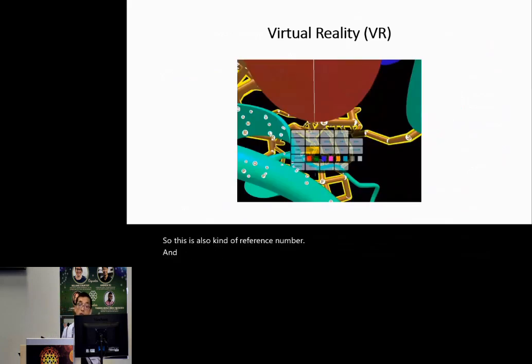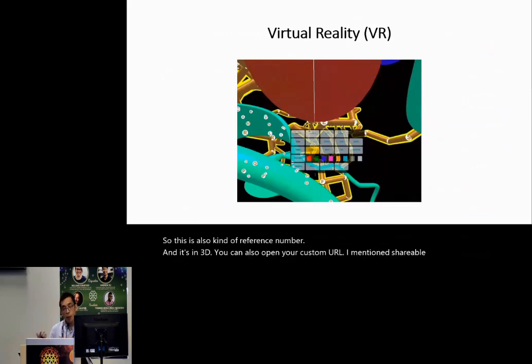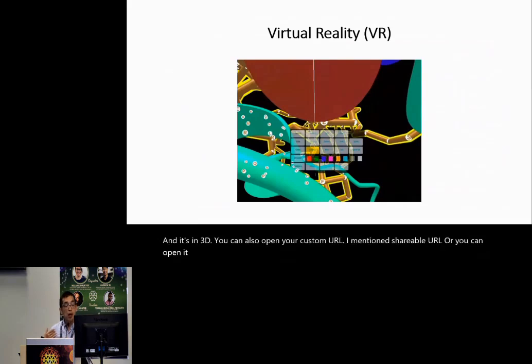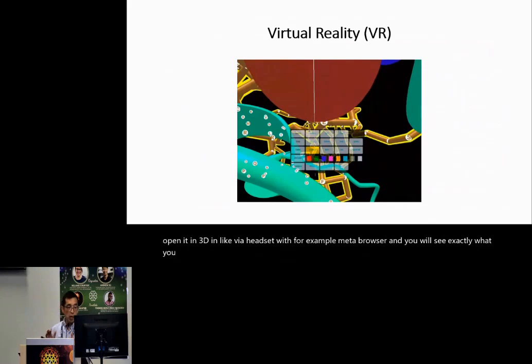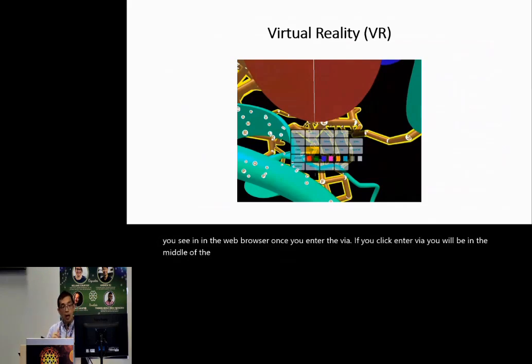In ICN3D, you can open a custom URL or a shareable URL, or you can open ICN3D in a VR headset — for example, with a Meta browser. You will see exactly what you see in the web browser once you enter VR. If you click Enter VR, you will be in the middle of the protein. You can zoom in and out, change color, do selection, or do analysis in VR.